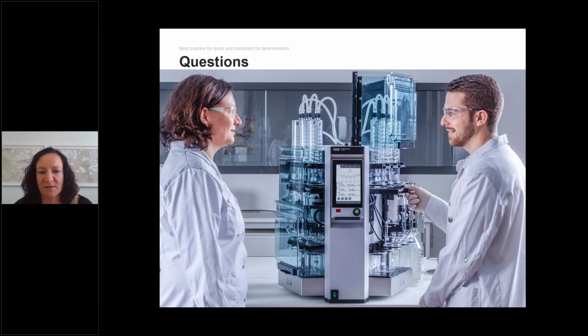Of course, it can vary a little bit depending on the sea level of your laboratory, or on the ambient temperature of your laboratory, or maybe on the quality of the petroleum ether, as this is a mixture. But then, of course, you're able to reduce or increase the heating level according to your need.